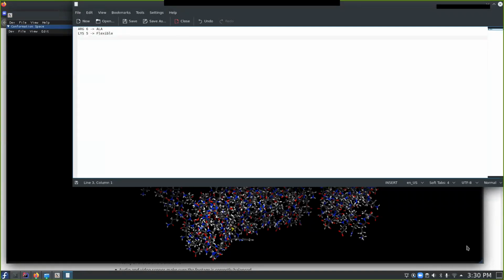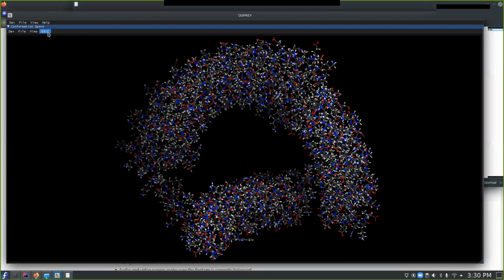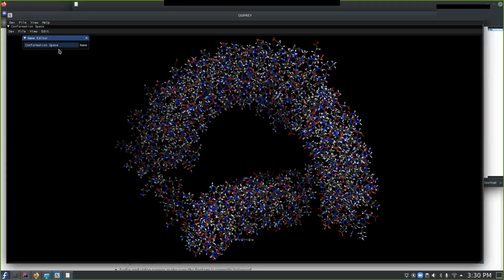And we'll say, I believe it's serine 371 in the protein, we'll say it's flexible. And residue 407 will also be flexible. Okay. So that's our plan. So the first thing we're going to do is give this conformation space a name, call it arm complex comp space.